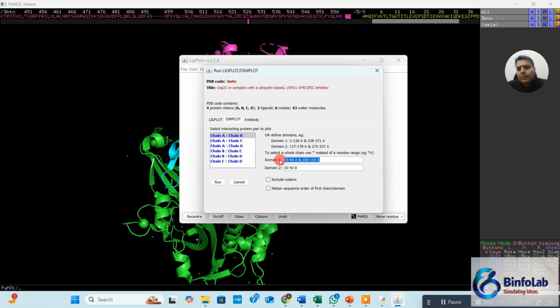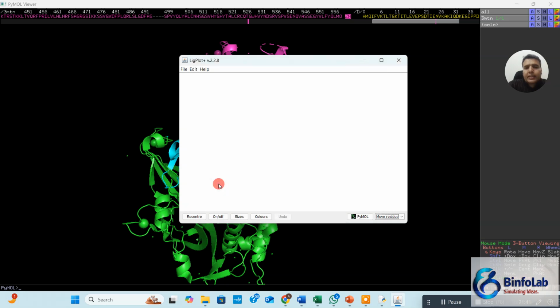Okay, so I'm not going to use this. I taught you how you will use it. So simply, if you are a beginner and you are interested in the interactions between chain A and chain B, click here and click run.